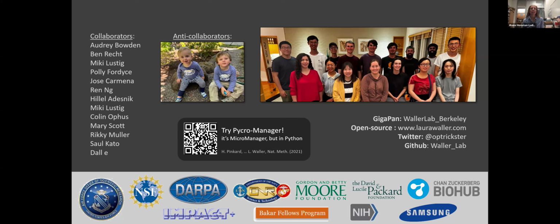Thank you. So we've got another question from Kit Curry. His lab works on zebrafish. So speed seems to be an issue in many of the hardware setups that you beautifully illustrated. So a thick, dynamic sample like the zebrafish larvae may not be optimal. Can you comment on current limitations for sample depth in dynamic imaging settings?